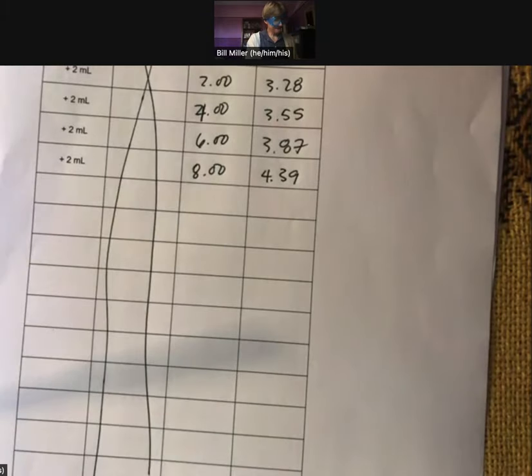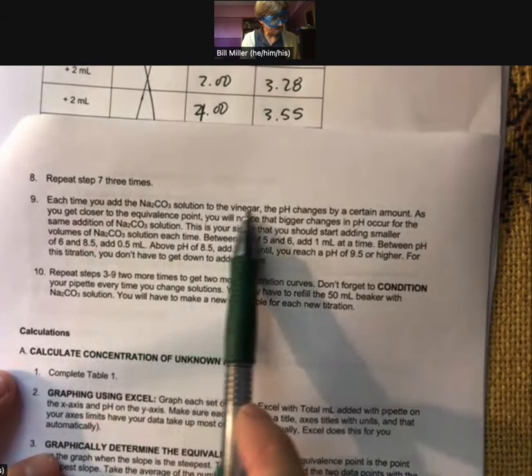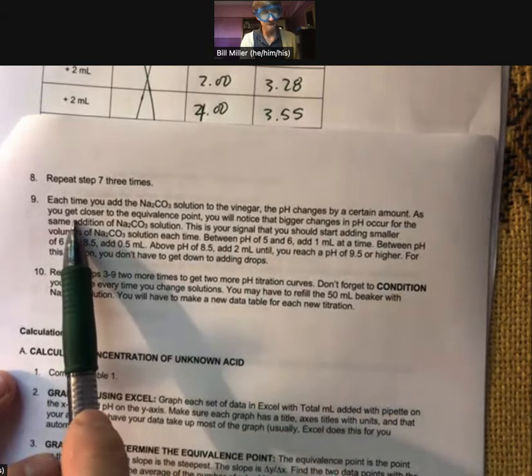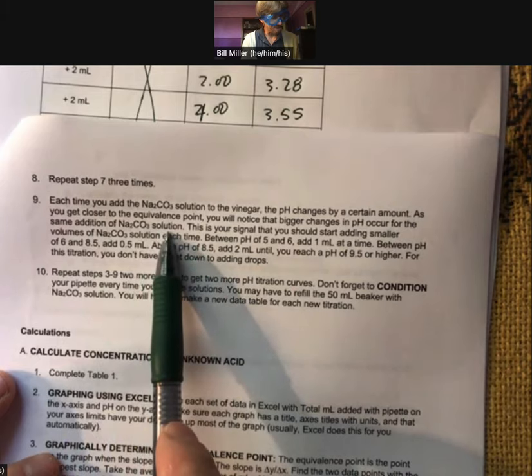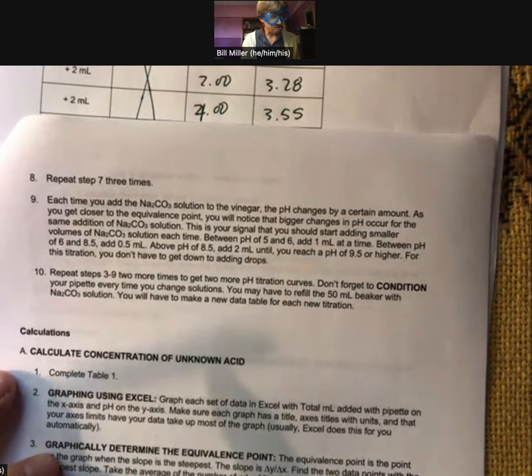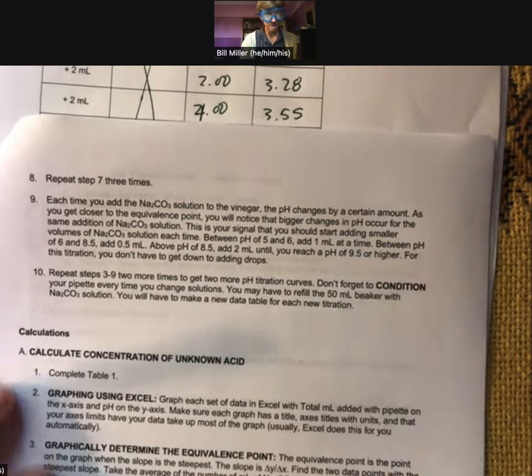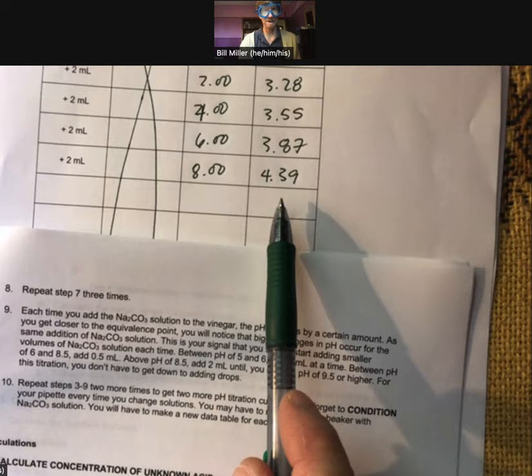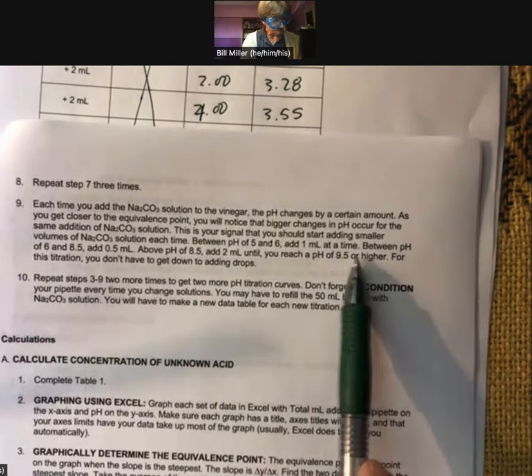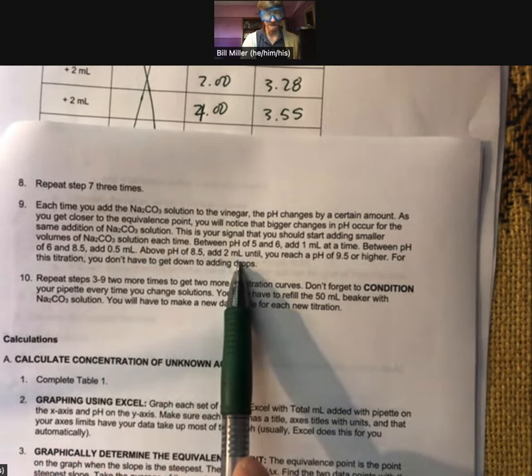Each time you add the sodium carbonate solution to the vinegar, the pH changes by a certain amount. As you get closer to the equivalence point, you'll notice bigger changes in pH for the same addition of sodium carbonate — that's your signal to start adding smaller volumes. When you get to pH 5 and 6, add 1 milliliter. Between pH 6 and 8.5, add 0.5 milliliters, then go back to 2 milliliters. We're still at 4.39, so I'll add 2 milliliters next.